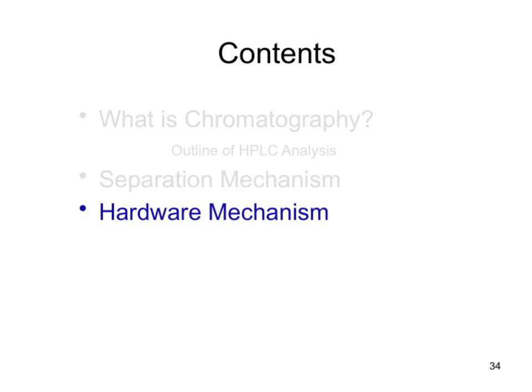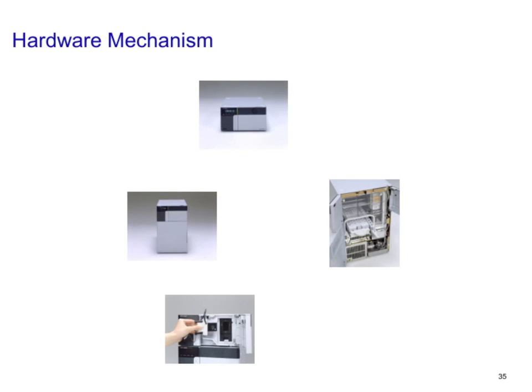Finally, the contents of this slide give us a broad overview, connecting the theoretical separation principles with the practical aspects of the instrumentation. Overall, this slide ties into our larger theme of understanding how HPLC allows us to analyze complex mixtures efficiently and precisely. Let's take a closer look at the pump type and how it influences our system.